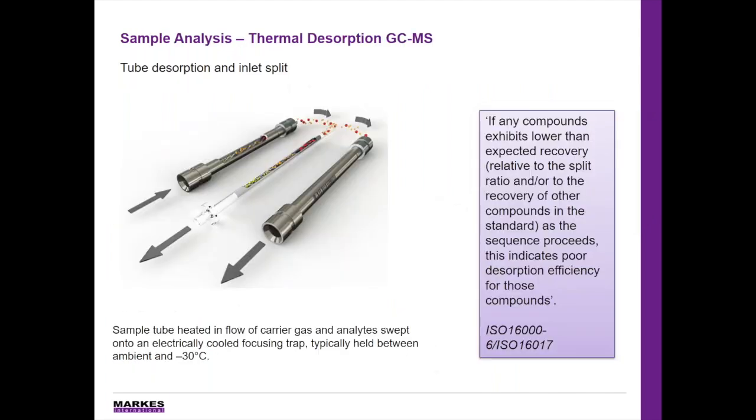Now we have talked about the different methods, how they sample the materials or the air from the car. But another important aspect to make the results reliable is that now you have the sample, you want to make sure that you are able to analyze the sample accurately. So here I'm going to spend a little bit of time talking about thermal desorption.